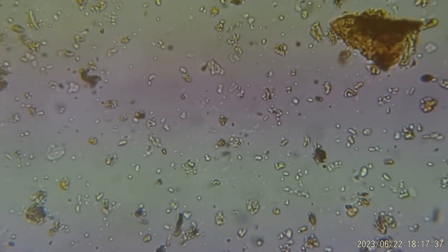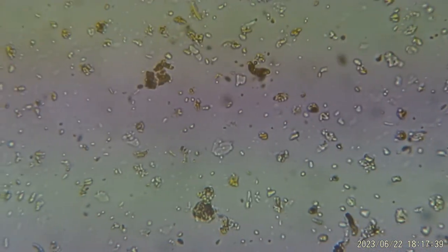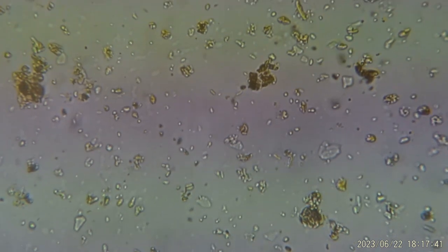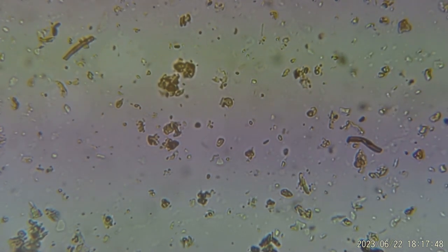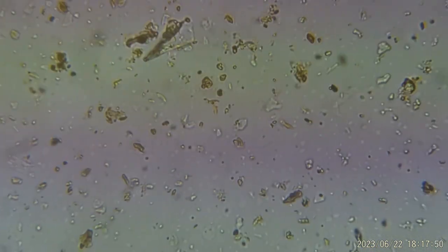I couldn't tell if that was actually on the slide or... So this A3? This is A3, yes. So we're seeing more fungi here. This is at 400 total magnification.